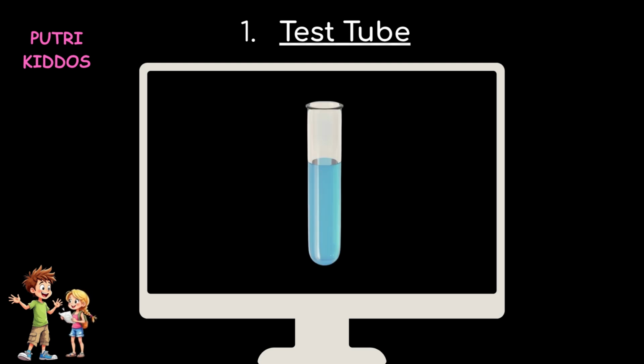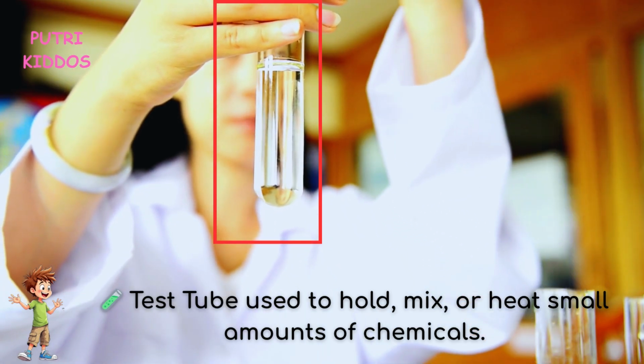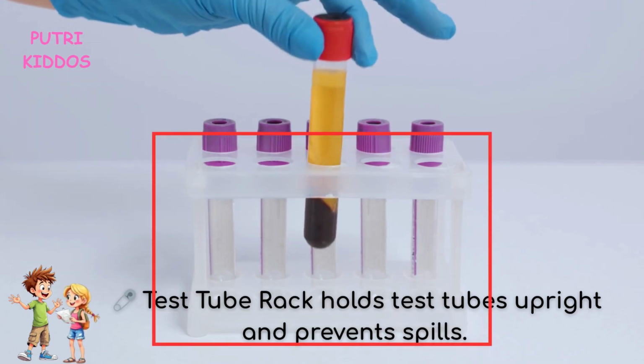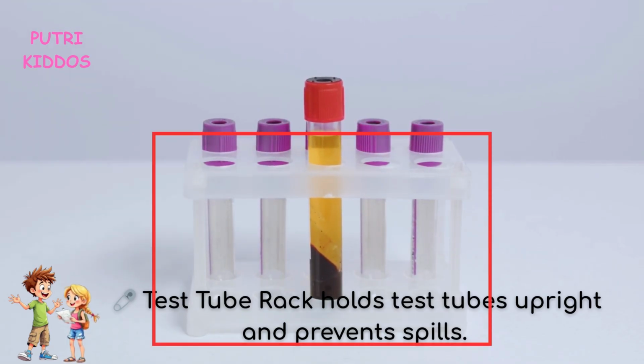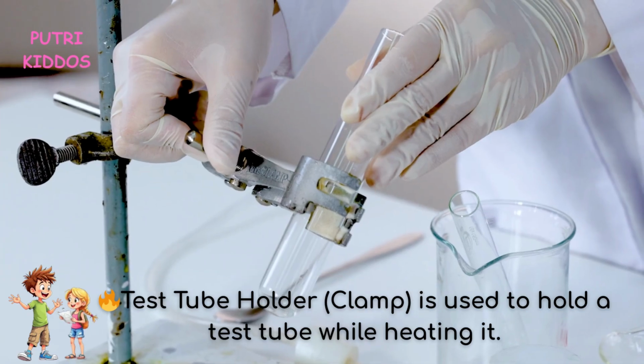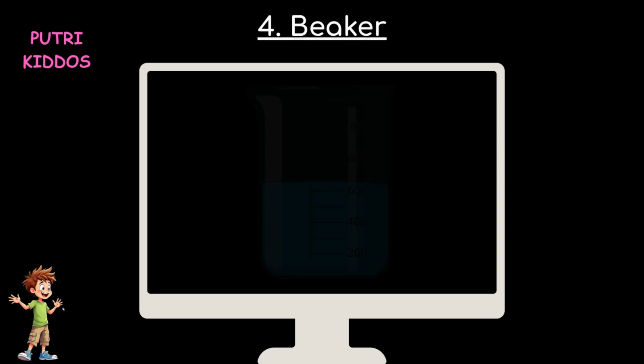1. Test tube. A test tube is used to hold, mix, or heat small amounts of chemicals. 2. Test tube rack. The test tube rack holds test tubes upright and prevents spills. 3. Test tube holder clamp. A test tube holder is used to hold a test tube while heating it.